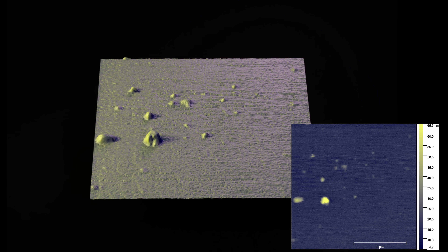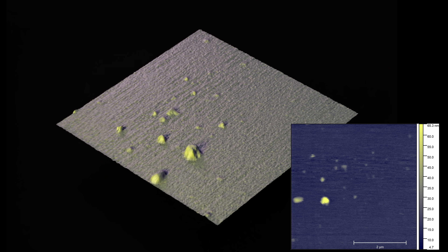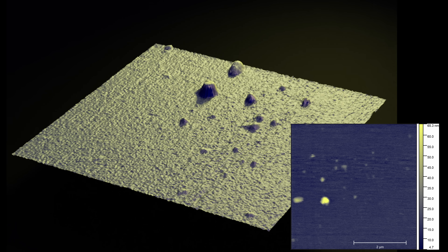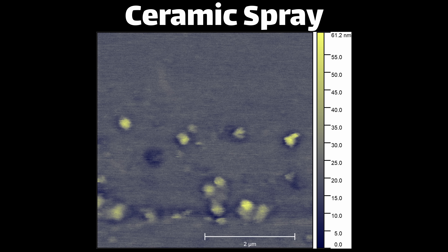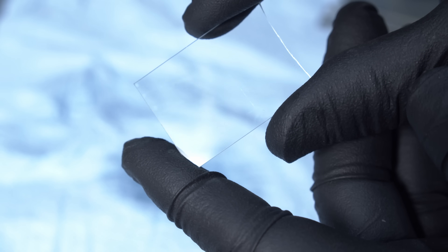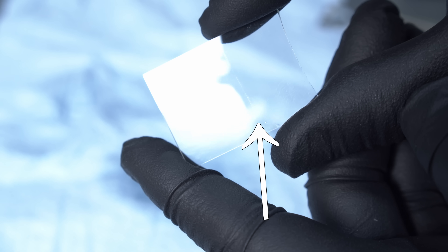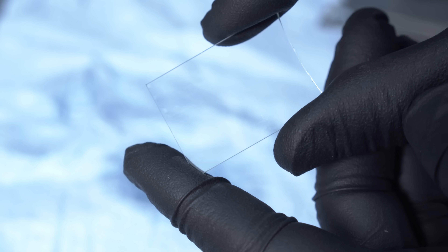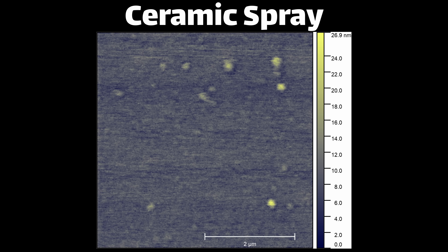Kind of disappointingly, there's just not a lot of it. I was expecting the entire field of view to be covered with small nanoparticles, because that's what's supposedly protecting whatever you're spraying. But in reality, we're seeing a handful of particles per five or ten micron field of view, which just means there's not a lot going on here. The areas next to the tape line are relatively more dense because the coating didn't get wiped away where the tape protected it. But out in the center where you'd be wiping or buffing the stuff off, it's pretty barren.